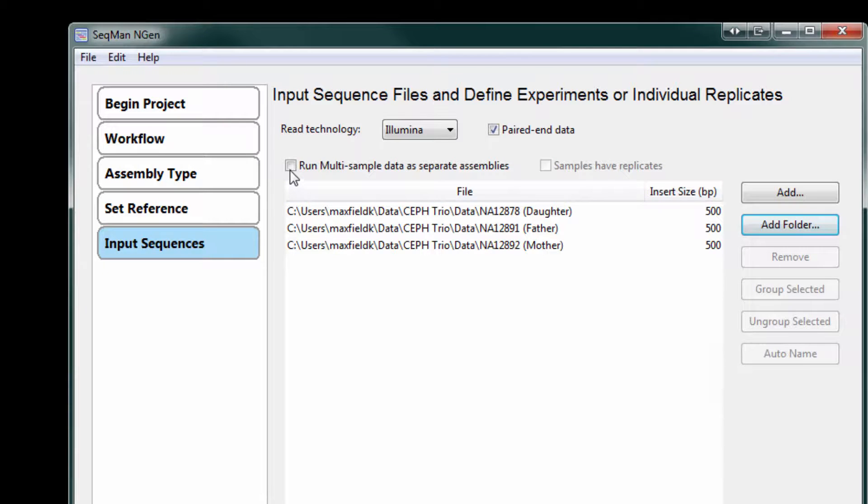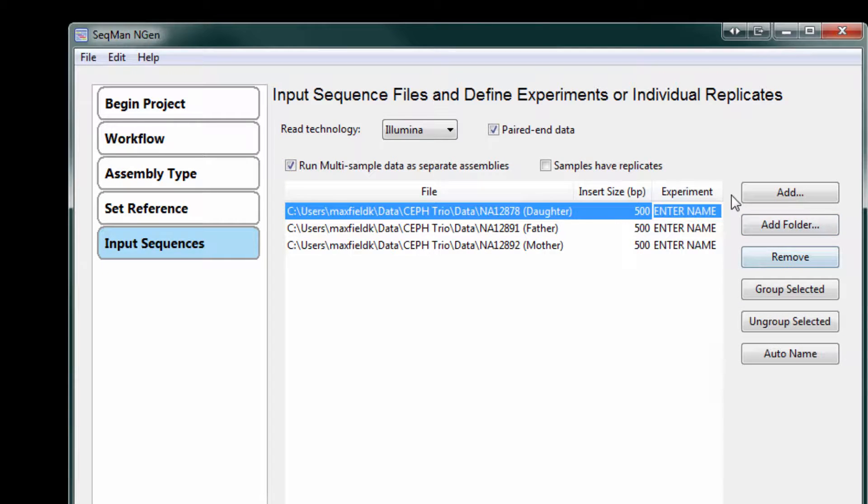Then, specify that we're running multiple sample data and enter a name for each sample.